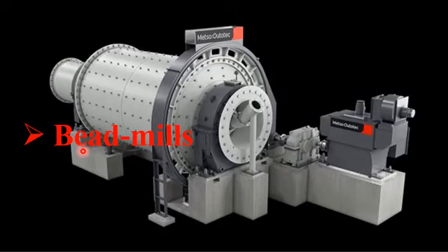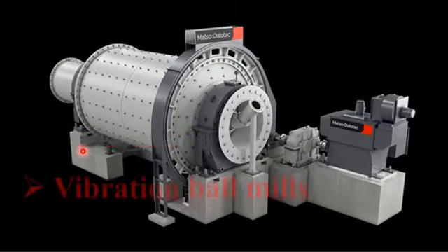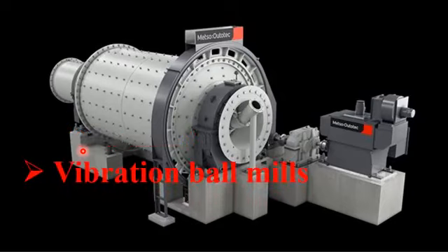Another type of milling machine used for the fabrication of nanomaterial is known as the vibrational ball mill machine. This machine is based on vibration. It is also known as the vibrational crushing ball mill machine.